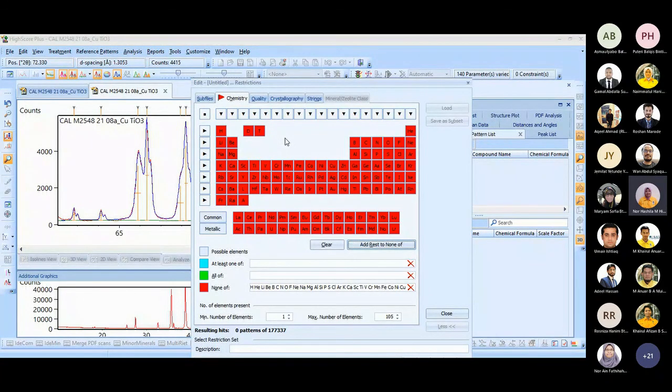the elements available in your sample to perform the XRD analysis, because XRD is not an equipment for elemental analysis. The purpose is always to see the crystal structure of the material. Okay. Previously we didn't have XRF, our XRF is under maintenance.